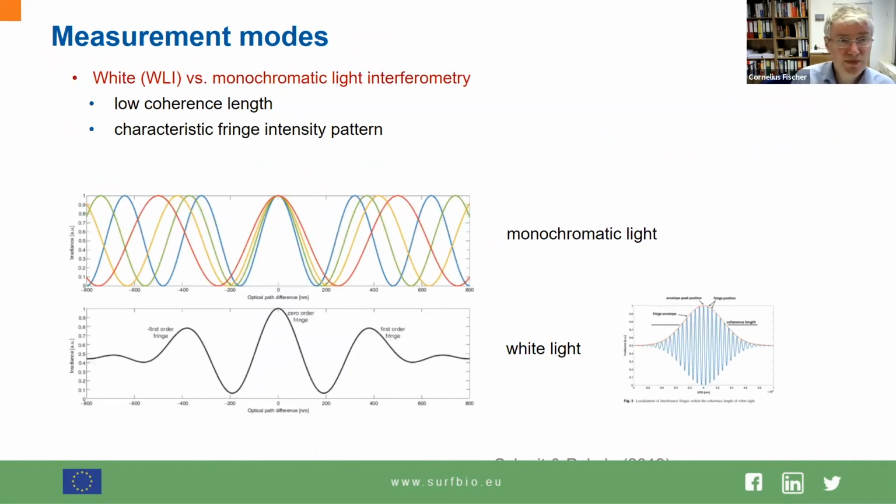So there's different measurement modes available, and this refers to the interference pattern with this dampening and the orange colored envelope curve that you have seen already earlier, a few slides earlier, when we discussed the general shape of this kind of instruments.